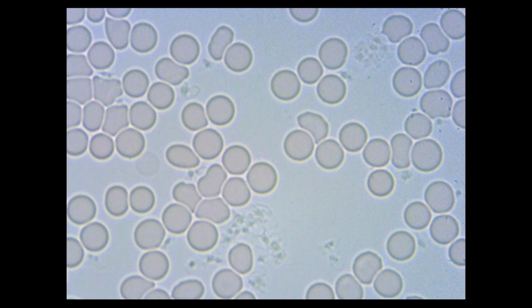And that's also why we recommend that no solvent materials are used when cleaning and wiping the lenses. So it's very important not to try and clean any of the internal components of the microscope. It's best just to keep everything closed as it is, because it's completely safe that way.